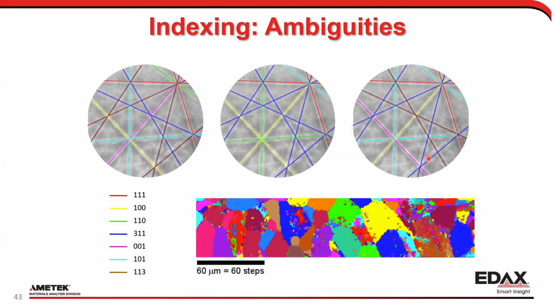What this means is that for some samples, the speckling will occur. Where is this common? This is most common in materials that are very slightly tetragonal. If there's any steel people out there, martensite is just a little bit tetragonal. Depending on the C to A ratio, you can't really tell the difference between a C axis and an A axis. And that's an open problem, really, in the EBSD community. I'll tell you that dictionary indexing does a better job at that. That's one of the reasons I think people are pushing dictionary indexing so hard, is that it does help get rid of some of these ambiguities that traditional indexing can see, where I can't see a difference between these 3 orientation solutions, because it's within my precision.